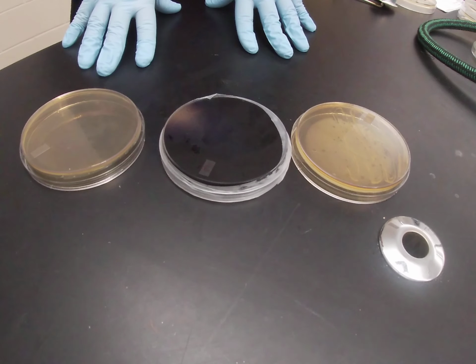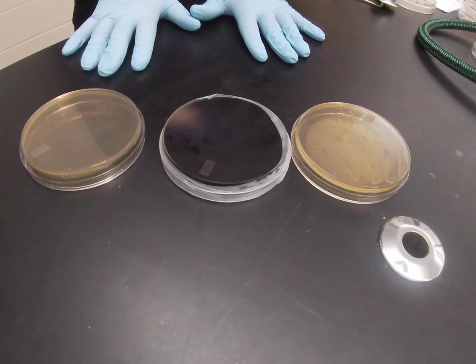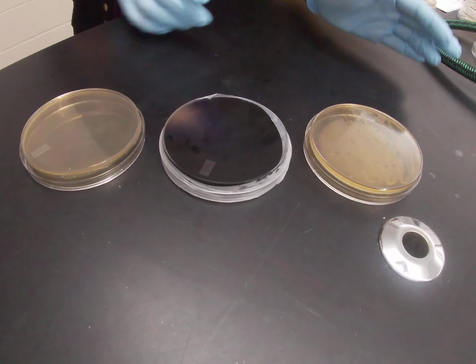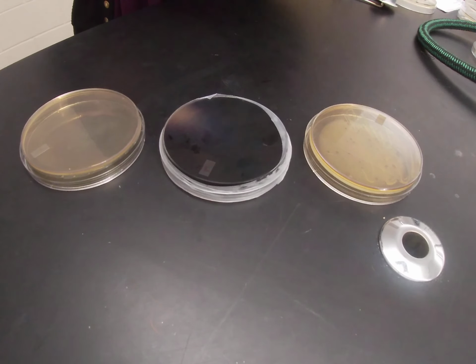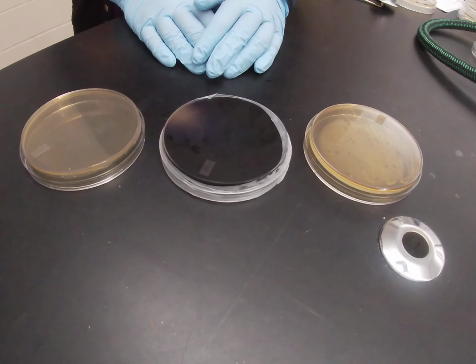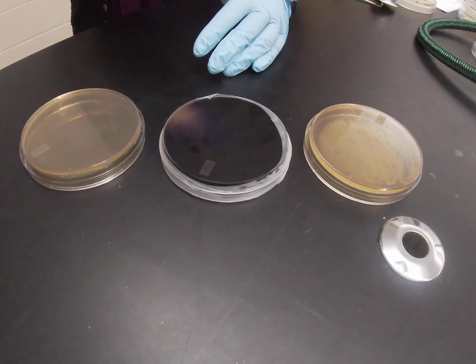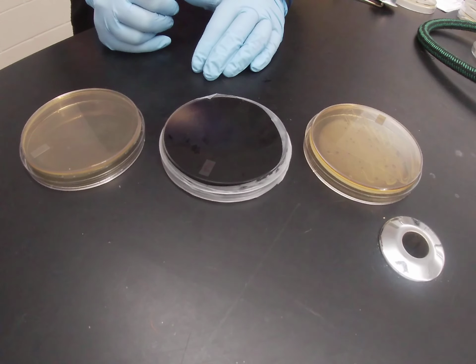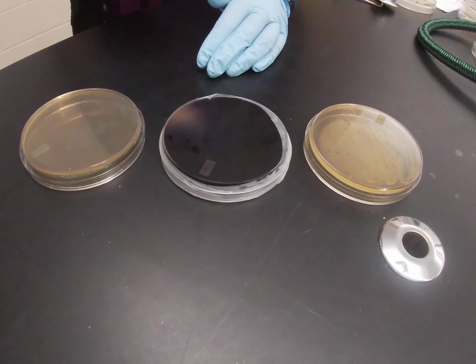All right, so in this video, I'm going to introduce Bile Esculin azide agar. Bile Esculin is a selective and differential agar. It is selective for certain gram-positive organisms. Not all gram-positives can grow on Bile Esculin, only certain ones. And it inhibits the growth of all gram-negatives. None of the gram-negatives that we work with can grow on Bile Esculin.